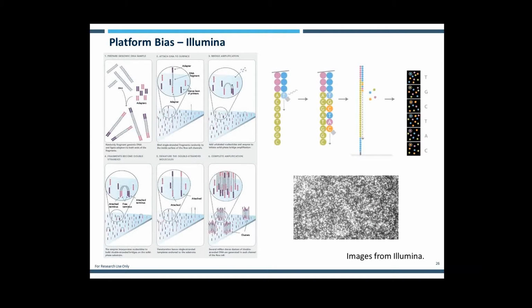And so when we look at Illumina's chemistry, this makes use of clonal amplification to generate clusters of short fragments, which is shown in the figure on the left. And then these are fluorescently detected using sequencing by synthesis. So as you've got your terminal base, as it's deprotected, then all 4 fluorescently labeled nucleotides are flowed over the flow cell along with the polymerase.